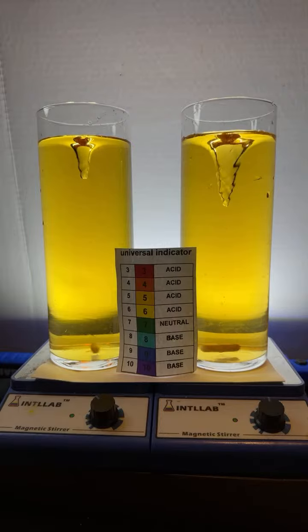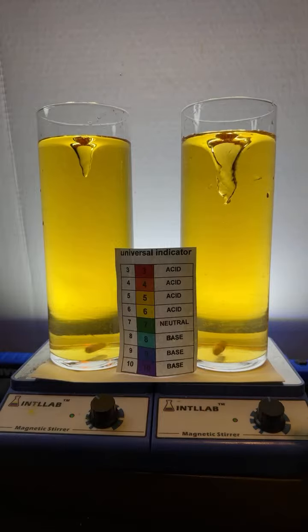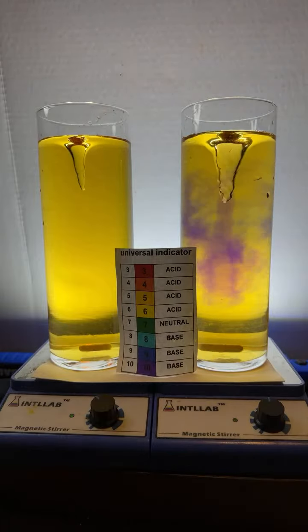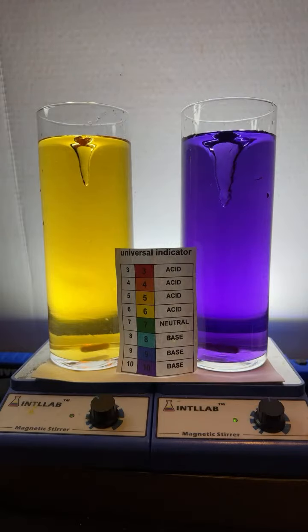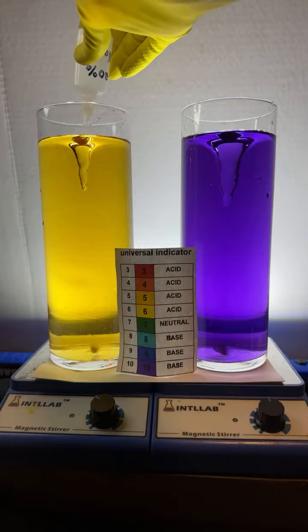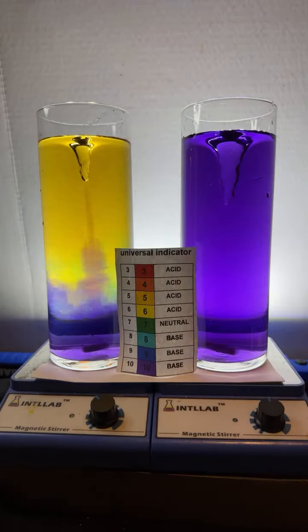Okay, now what I'm going to do is add just a little drop of sodium hydroxide. That's a base, 20% by weight. Sodium hydroxide over here on the right, just one drop. Boop, in it goes. And look at that gorgeous color change, huh? Isn't that beautiful? Now we're going to do the same thing over here on the left. One little drop of sodium hydroxide base, 20% by weight. In it goes. Look at the gorgeous flow pattern.